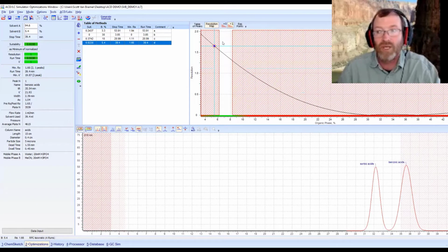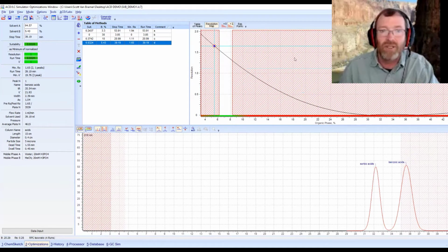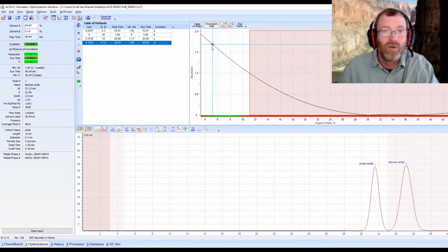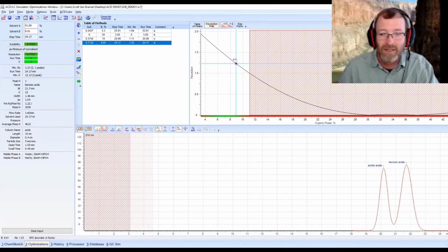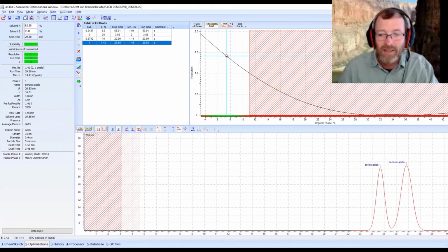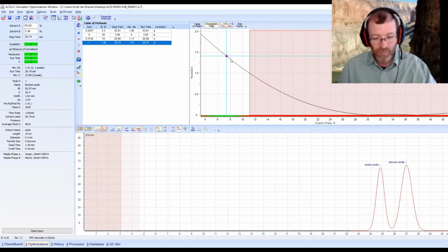And so that lets you ask the question, what's most important to you? And then as a class, we could talk about how we could get this system resolved, right? We could get a well-resolved experiment in 30 minutes. And so we could ask the question whether or not that's a fast enough runtime that we can successfully complete the experiment in a reasonable amount of time.